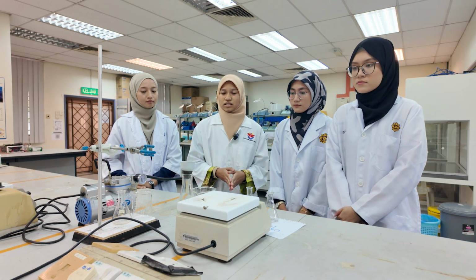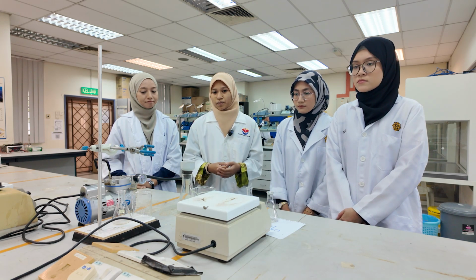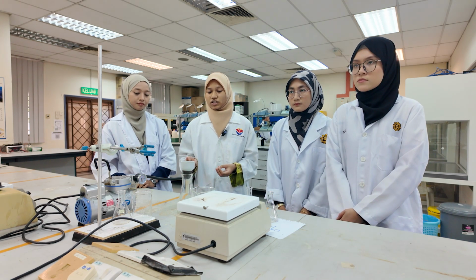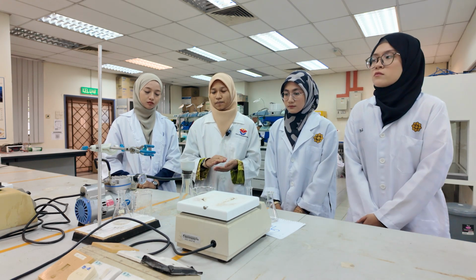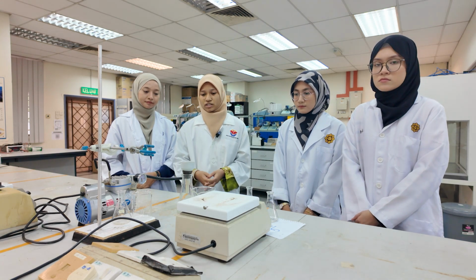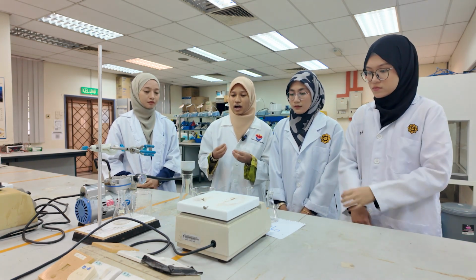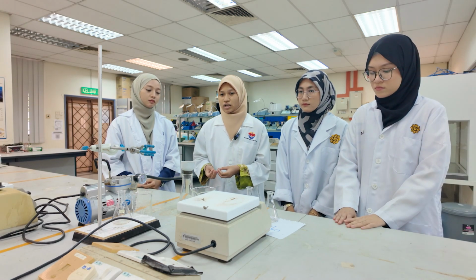It is very necessary to make sure that the recrystallization is done, because it removes the impurities, so we can ensure high purity of the product that we need.